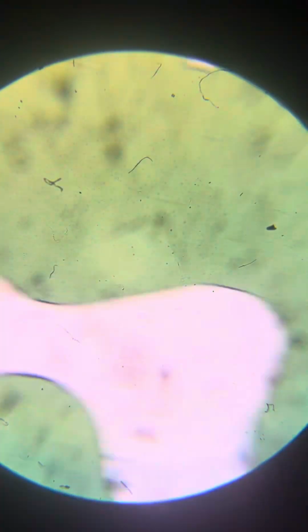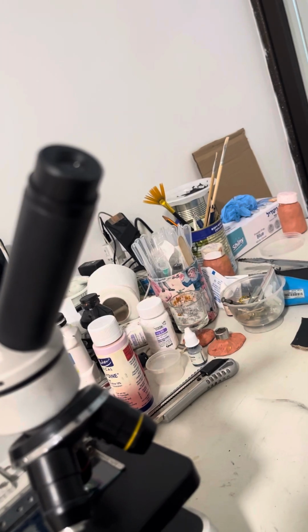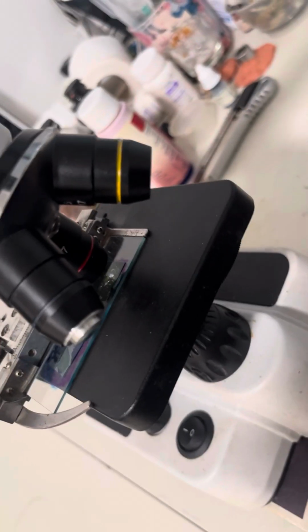Okay, so not very successful because we've not seen many trains, but we see many Neos, which is fine. Maybe it's just bad luck, because we've seen at least two that are definitely trains, but small ones, not impressive ones. Let's see how it goes with the other slide. If it doesn't go too well, we'll take additional samples.